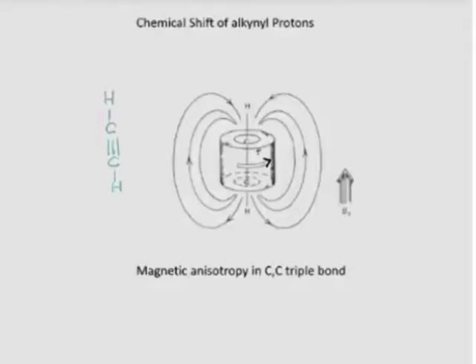Let's now look at the chemical shift of alkynyl protons. It is a proton attached to a carbon-carbon triple bond. The external magnetic field is shown here, pointed up.